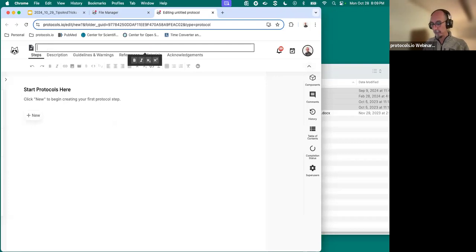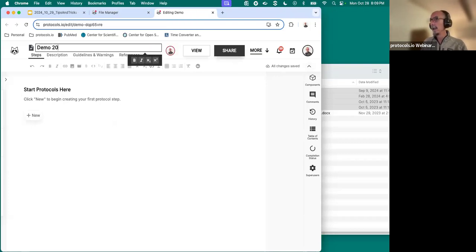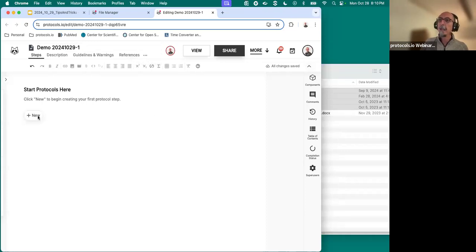and let's use, this is just a demo, I'm going to use today's date and number 1. So I could start adding steps, but that's not what I'm going to do today. I'm going to go to the description tab.